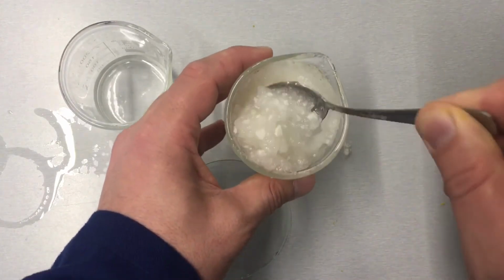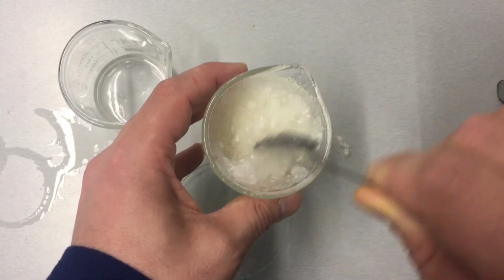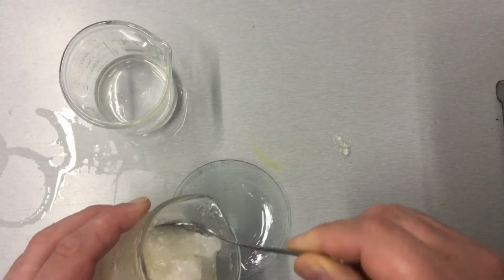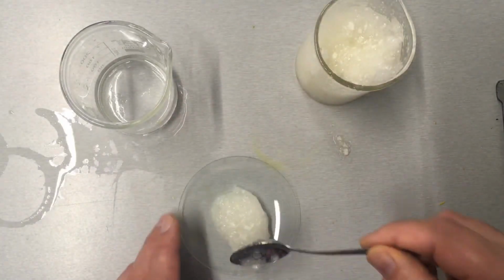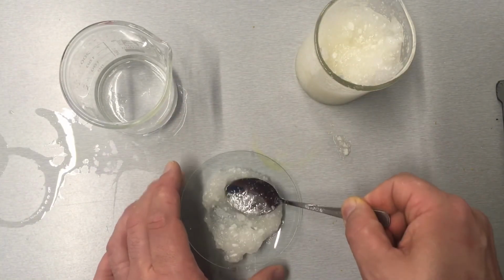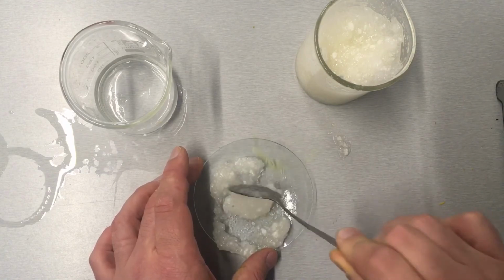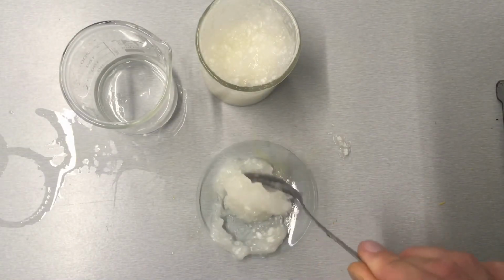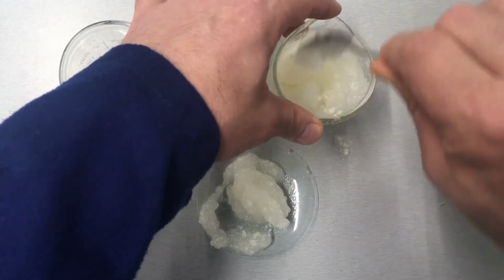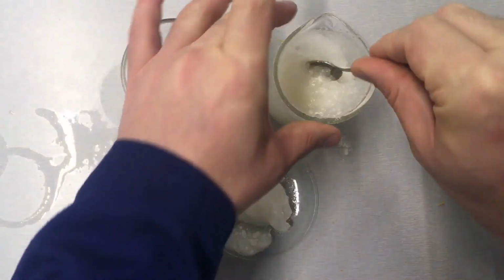So how does that look to you? What do you reckon you can see? How's the physicality of the liquid and the powder changed? I'm just going to pour some out. I'll spoon it out onto this watch glass here. As you can see, it's certainly changed. It's formed almost a very jelly-like solid. So the powder has definitely been hydrated, just like within hydration powder, and it's formed what you can see in front of you. So obviously, guys, you need to record what evidence of change you see in the results table as well. Okay, that's activity 3.